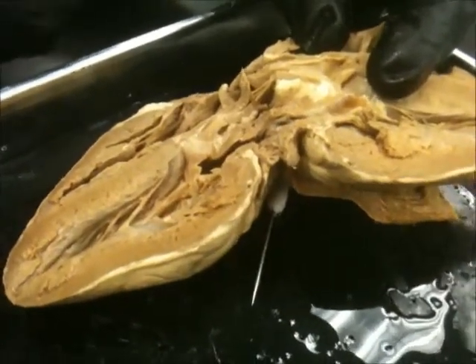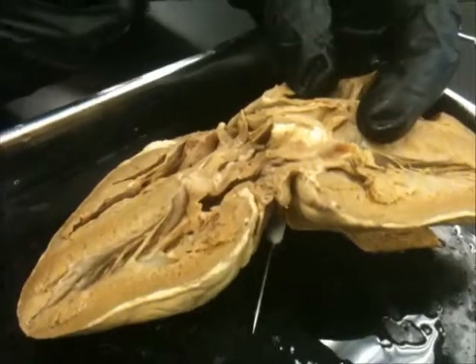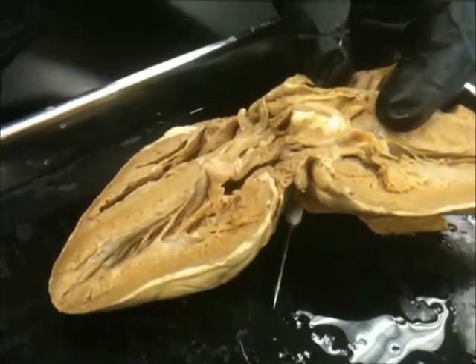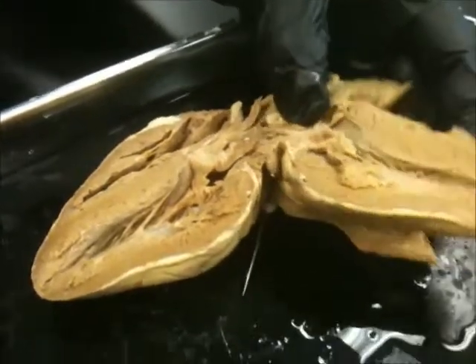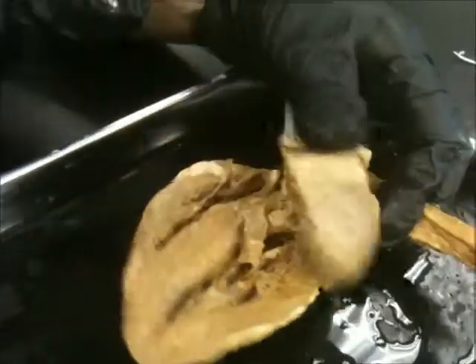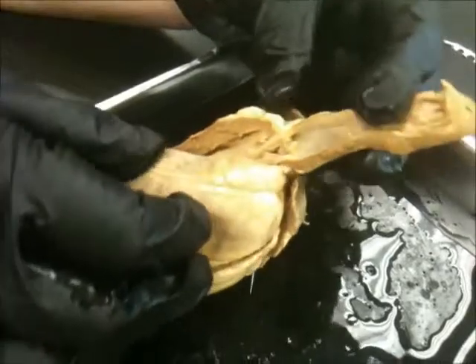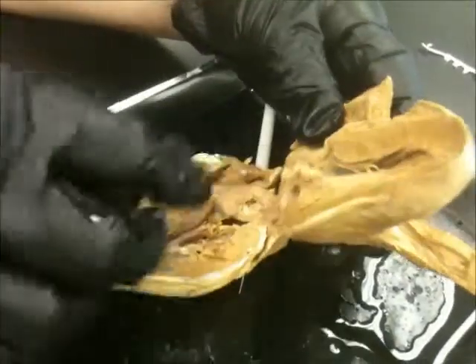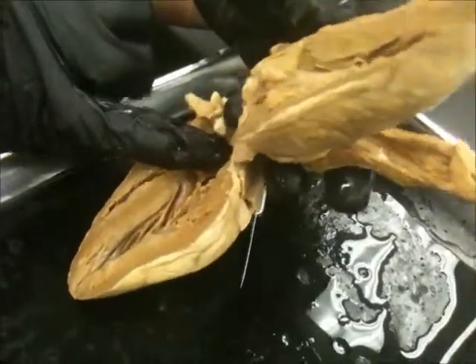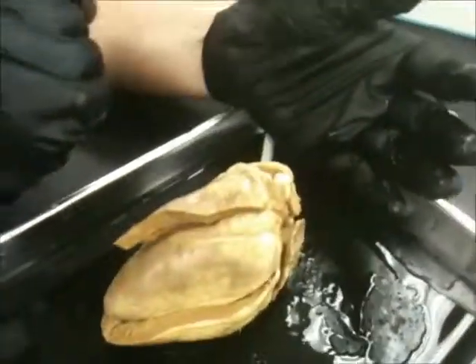You won't see the ligamentum arteriosum on the sheet because it's dissected differently and it's just too small on the cow's heart. We've got the ventricles down here and the pulmonary trunk — remember, it's anterior to the aorta, and it's going to move from the right ventricle up to the lungs. You've got your tricuspid valve and the pulmonary semilunar valve, which is going to be hard to find. And the interventricular — we've done it. Peace out.